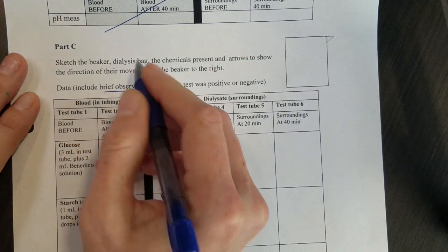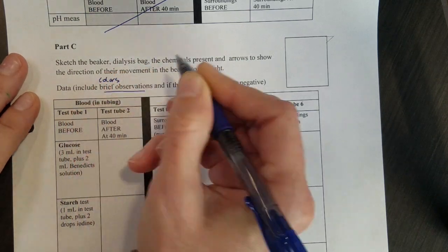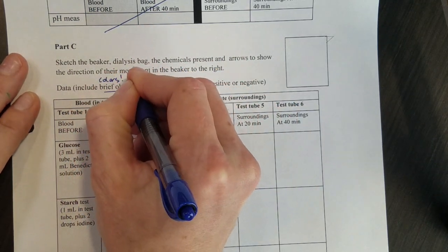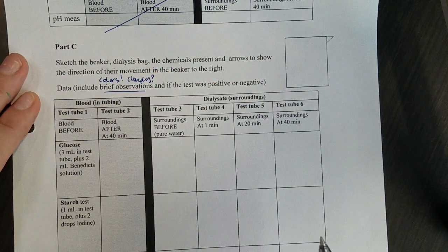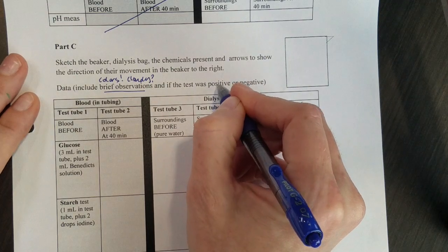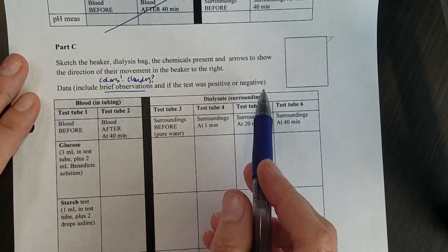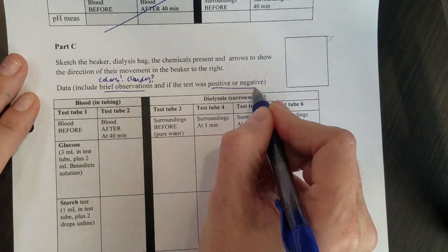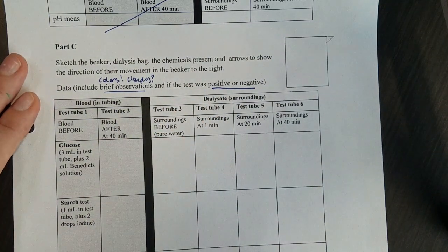Make sure that you have observations. That's going to be colors in particular, or is it cloudy or very thick and white. And also is it positive? Is there glucose present or is it negative? Make sure you have both of those to get full credit on your observations.